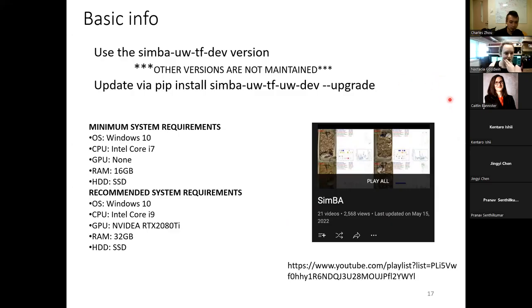Okay, so you do not need a GPU to use SimBA. The GPU is purely for pose estimation. The better computer you have, the faster everything runs, as is generally the case. But Simon and I both use this on our Macs, and it has compatibility with Linux also. In Linux, you're going to get more path errors because of backslashes versus forward slashes, but I think we've ironed most of those out at this point.